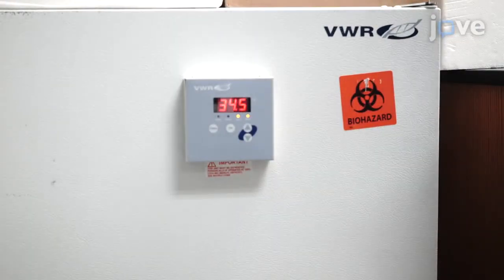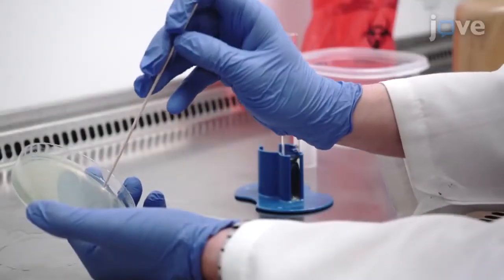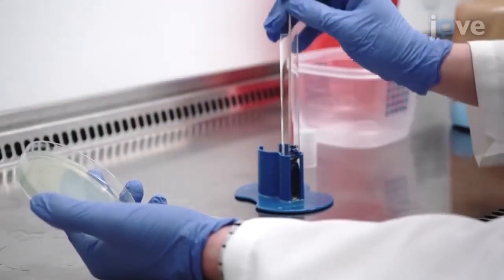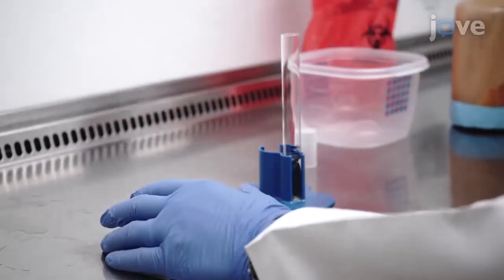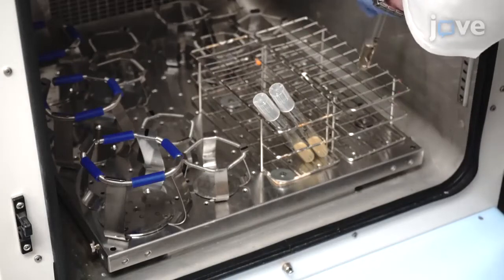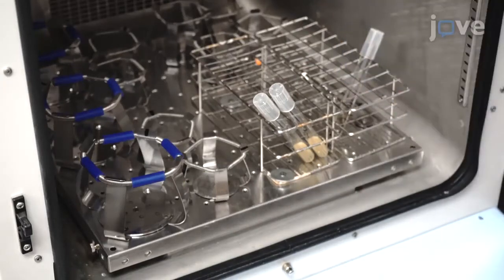Then store the plate at 4 degrees Celsius for up to one week. Two days prior to setting up assay plates, use a single colony from the plate to inoculate 3 to 5 milliliters of sterile LB broth. Incubate the culture at 37 degrees Celsius for 12 to 16 hours.